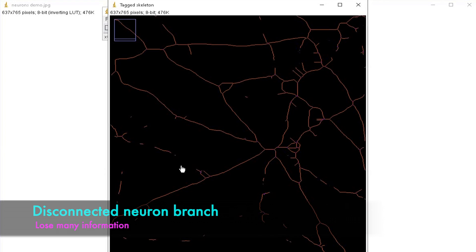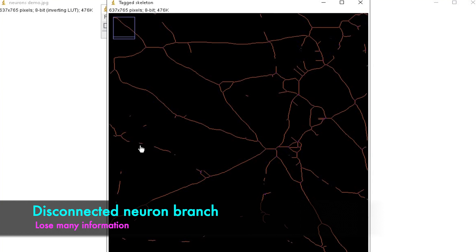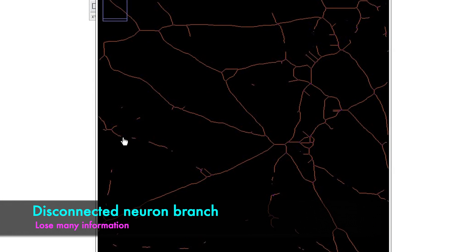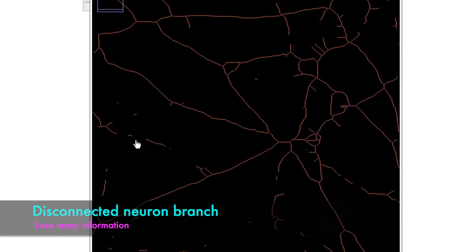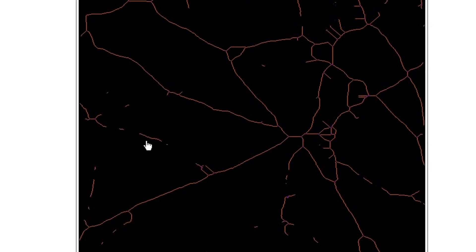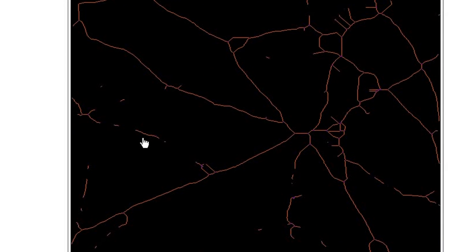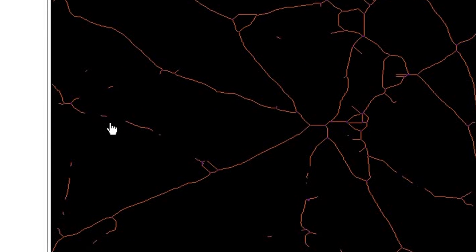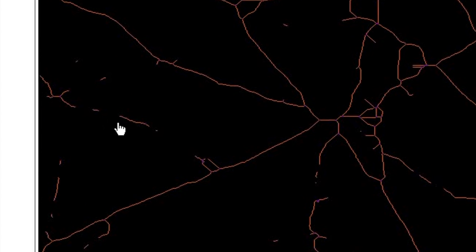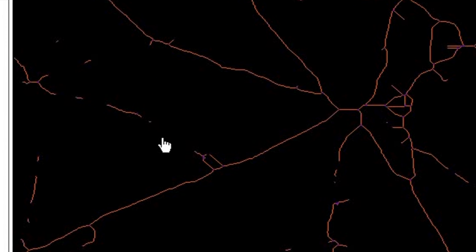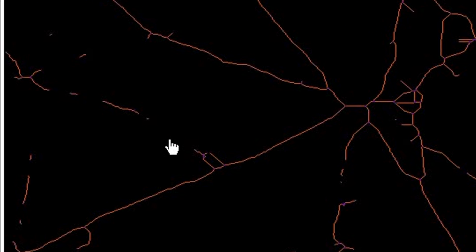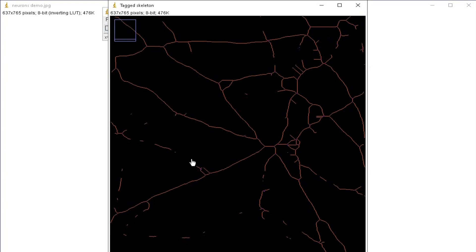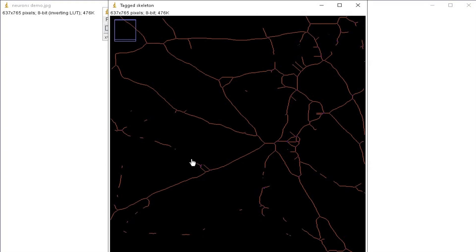Earlier we talked about the consequence of not connecting the branches in this part of the neuron. Since the gap was left disconnected, the branching information is lost for this part of the branch. Therefore, it is best to connect all the branch points as much as possible.